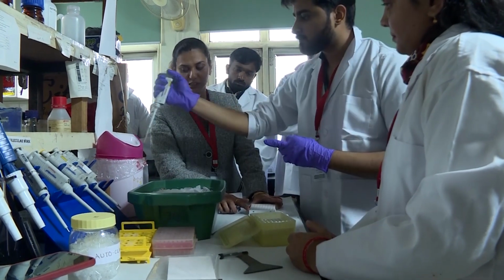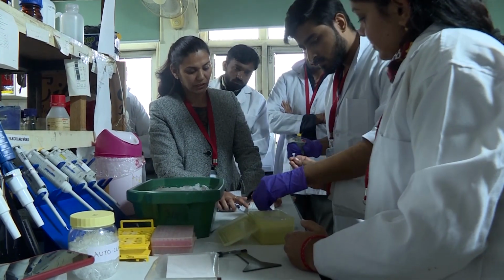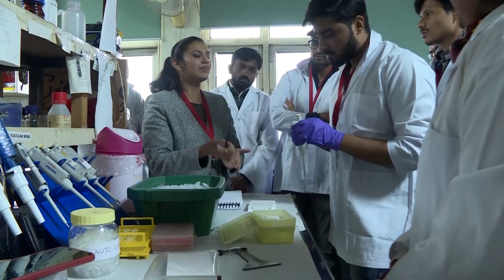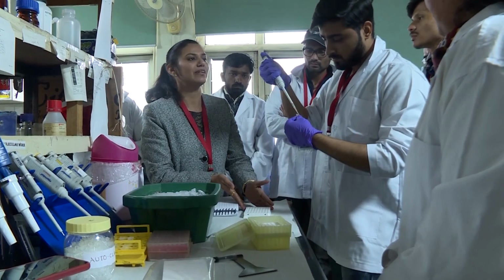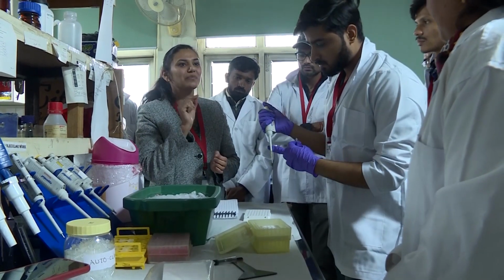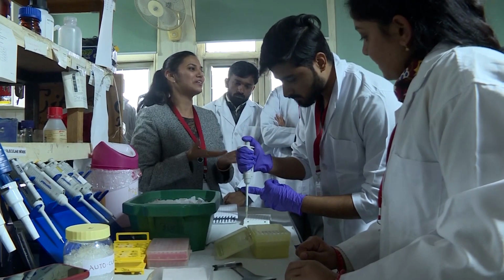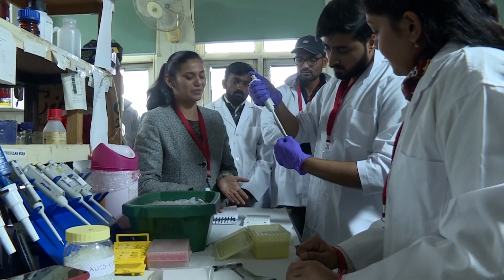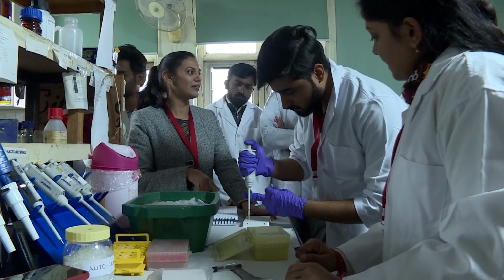Okay. Now heat stress gene. It is A2, B2. While putting our sample into the plate, we have to be very careful since here only 8 samples are there. Sometimes we are using 96 well plate, 96 samples. So we have to be very careful, should not miss a single well. Otherwise, in the whole experiment you will be confused about what we have loaded, and you will not get the proper result. So you have to be very focused while loading your sample.